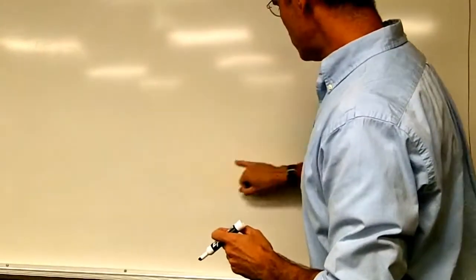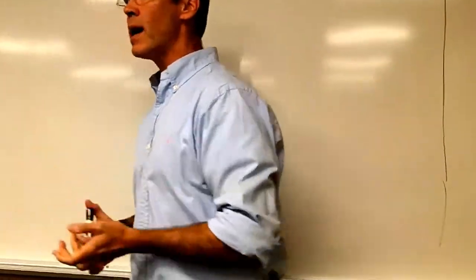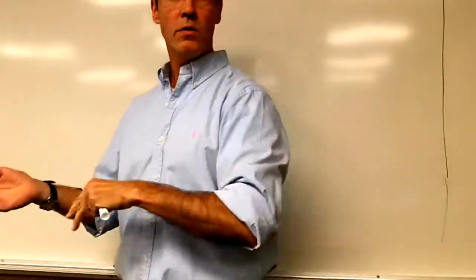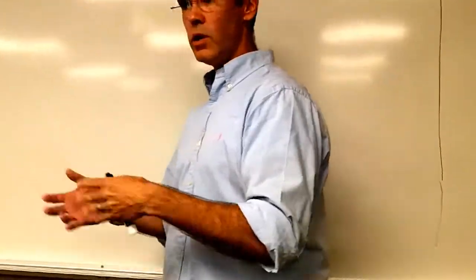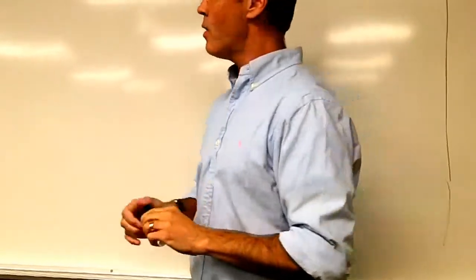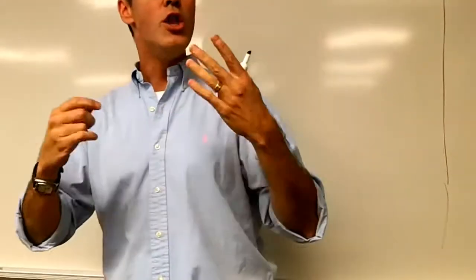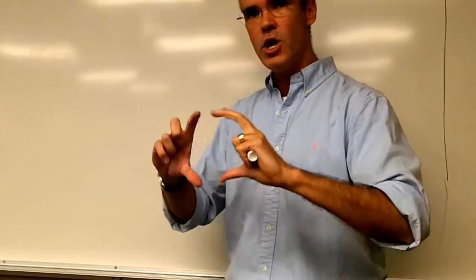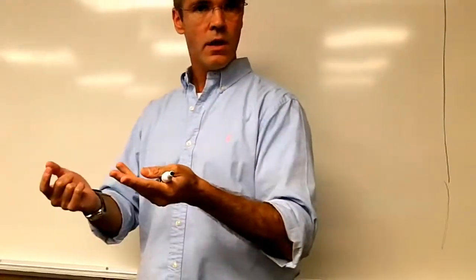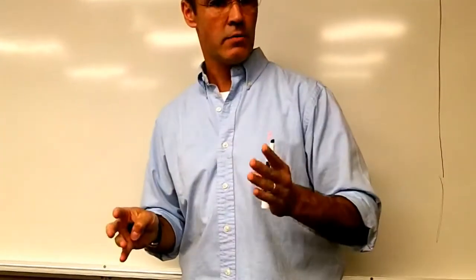Okay, here we go. So what I want you to... I'm not going to go back on everything we did yesterday. Okay? I'm not going to go back on the problems on V1, C1 equals V2, C2 and all of that. I posted problems for this, so you will test that just like I told you. What I want to come back on is the calibration curve or the unknown and what to do, the dilutions, and what to do in order to find what an unknown is, and use the spectrophotometer in order to find what the concentration is, right?